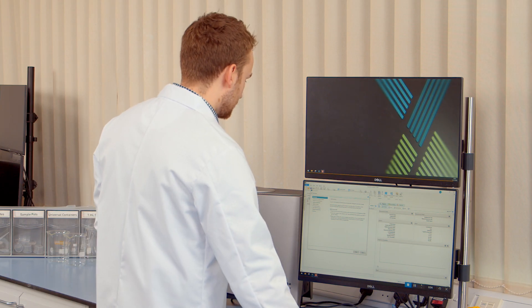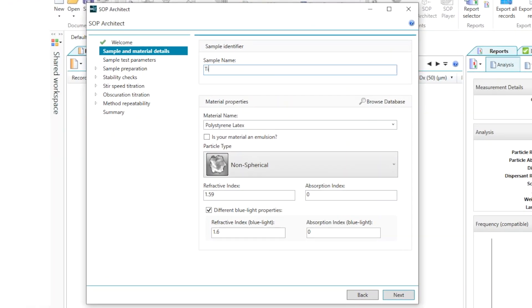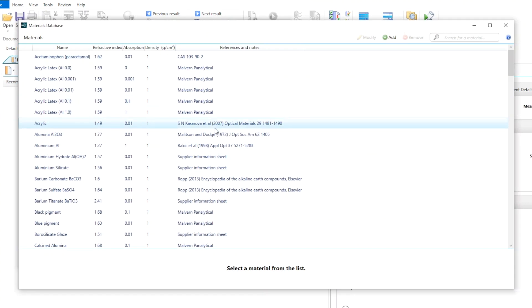I'll now carry out an example by measuring this titanium dioxide powder. So the first thing that we'll have to do is input some information about our material. We'll be looking at a titanium dioxide sample today and we can find the optical properties for this material within the Malvern Panalytical database.